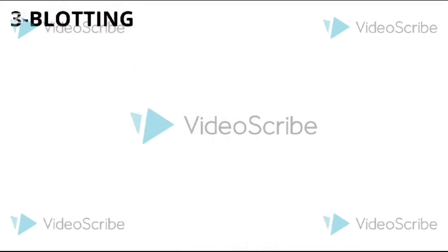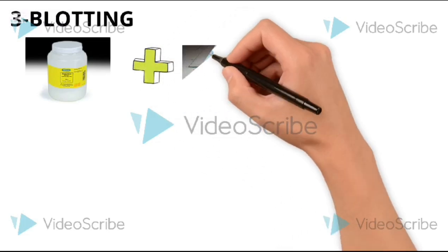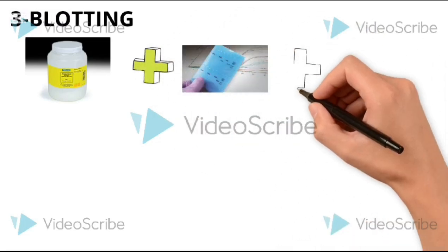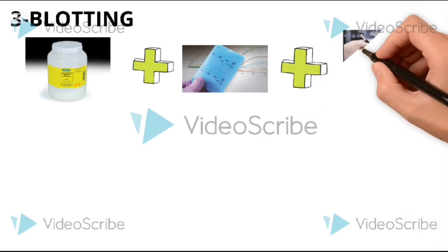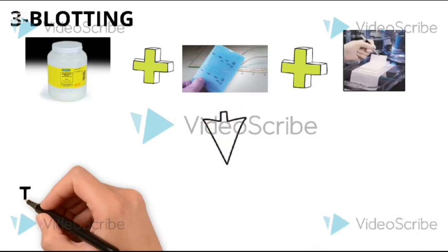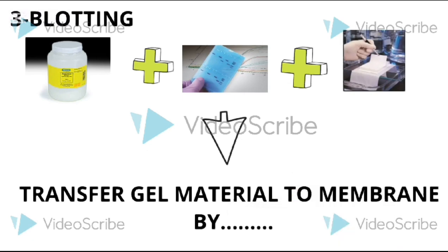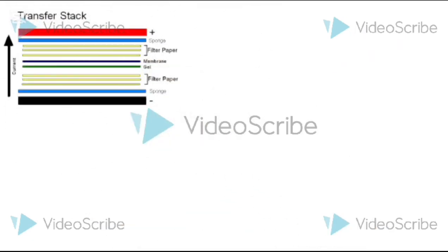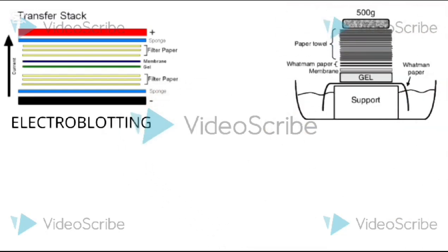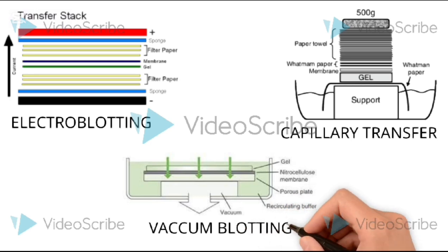The third step is blotting, that is the actual transfer. For this, we assemble our transfer buffer, the gel, and the membrane on which we are going to transfer our molecules. Then, the proteins from the gel are transferred to a nitrocellulose or polyvinylidene fluoride membrane by various methods. The transfer can be done by electroblotting, that is by providing current, by capillary transfer, that is by use of filter papers, and also by vacuum transfer, that is by creating a vacuum in the chamber.